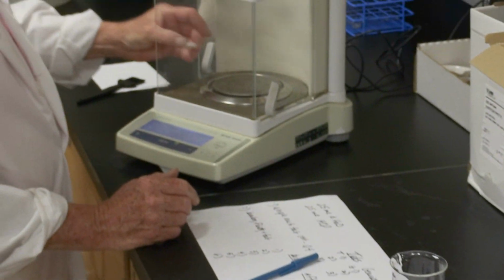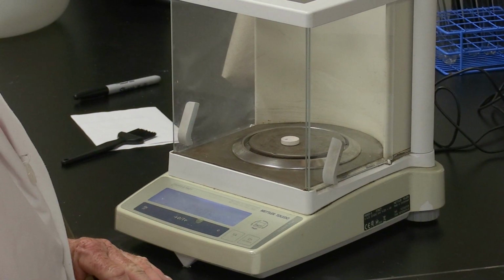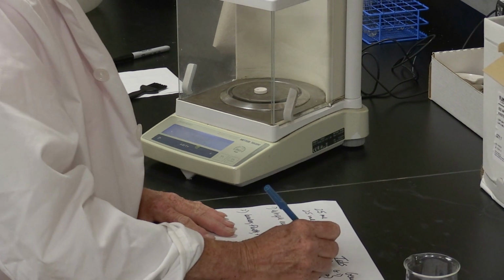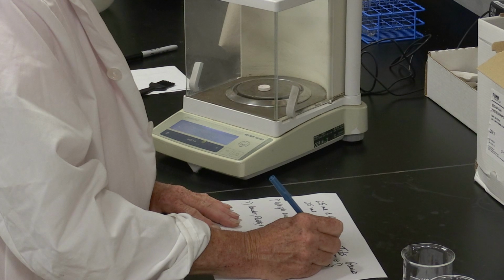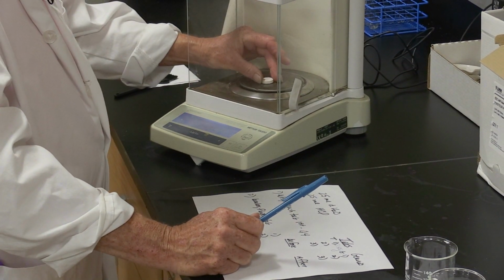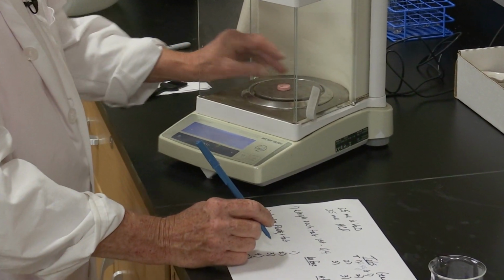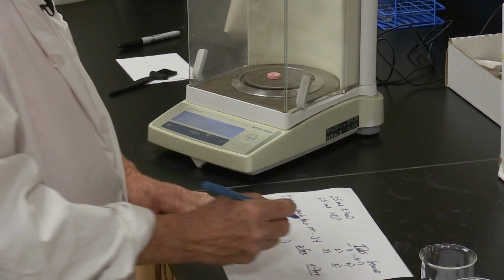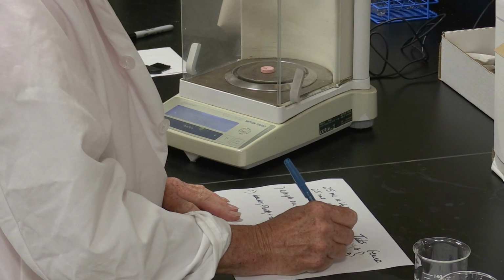All right, so Tums 1 tablet weighs 2.405 grams. Tums 2 tablet weighs 2.587 grams.